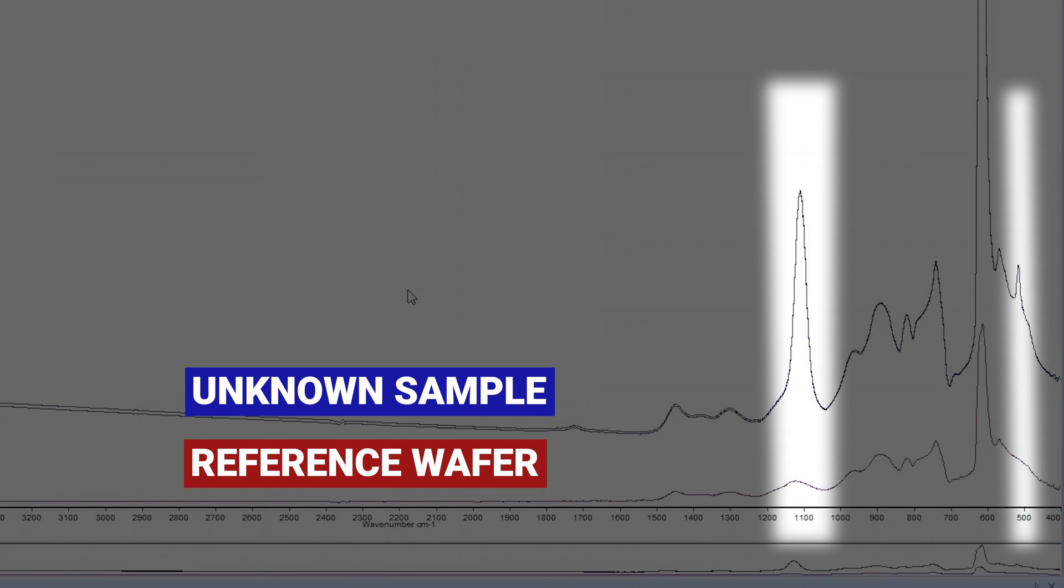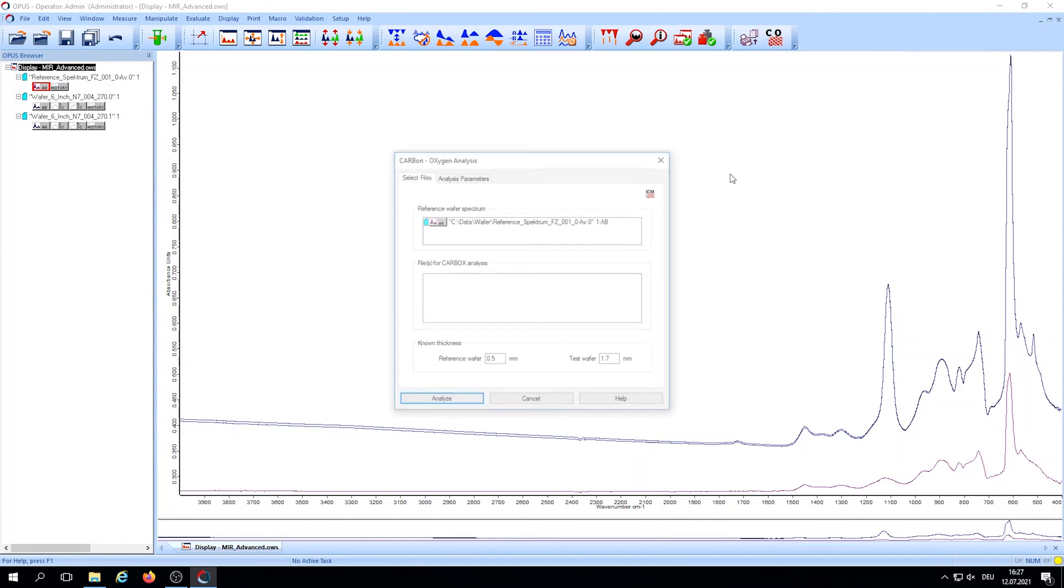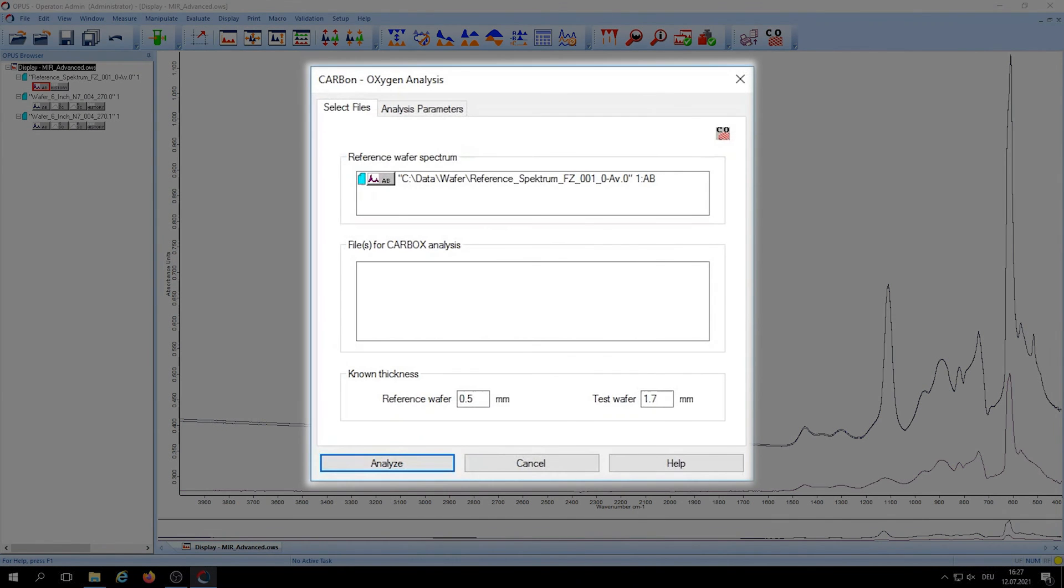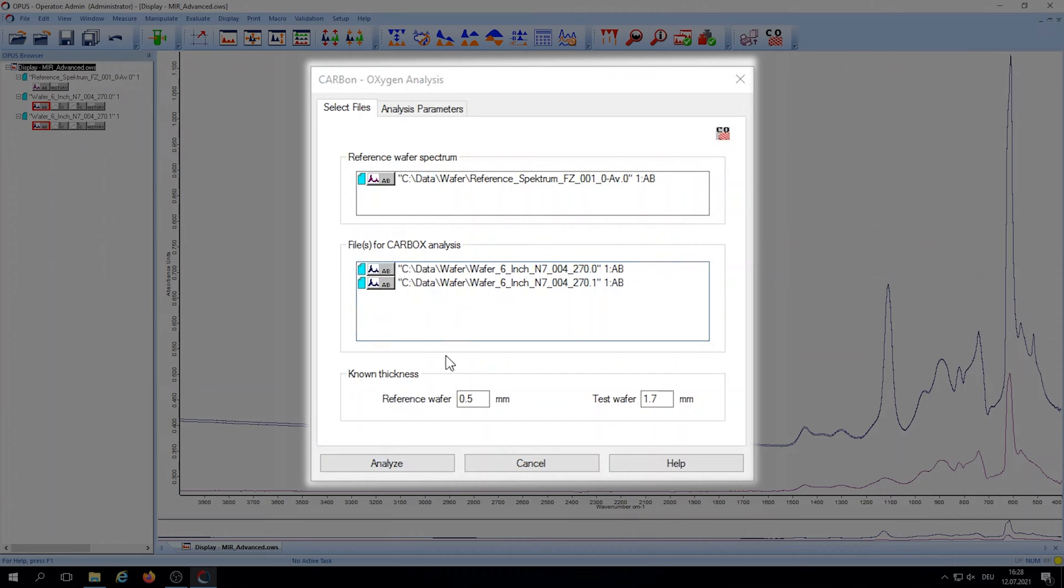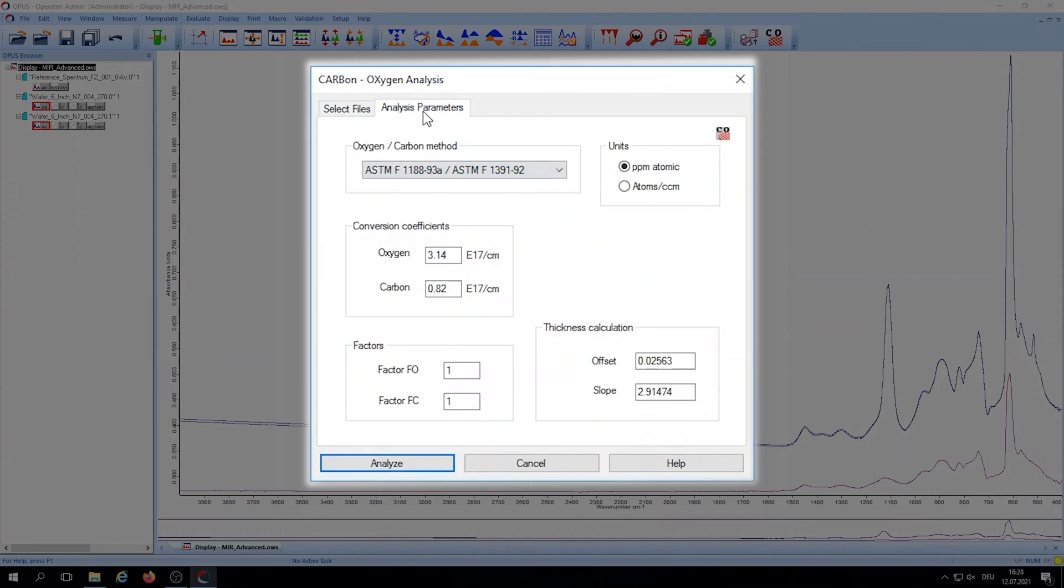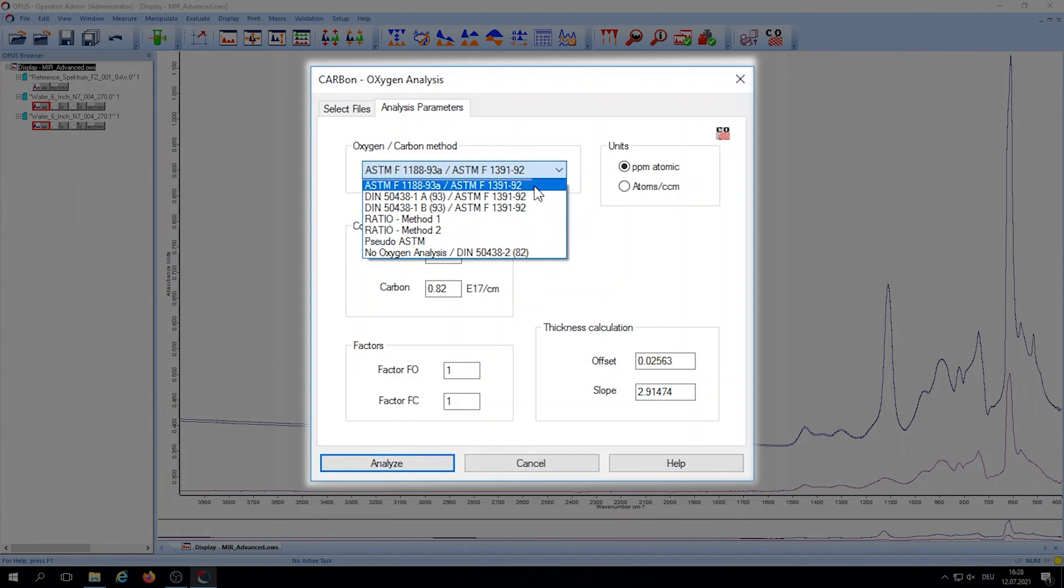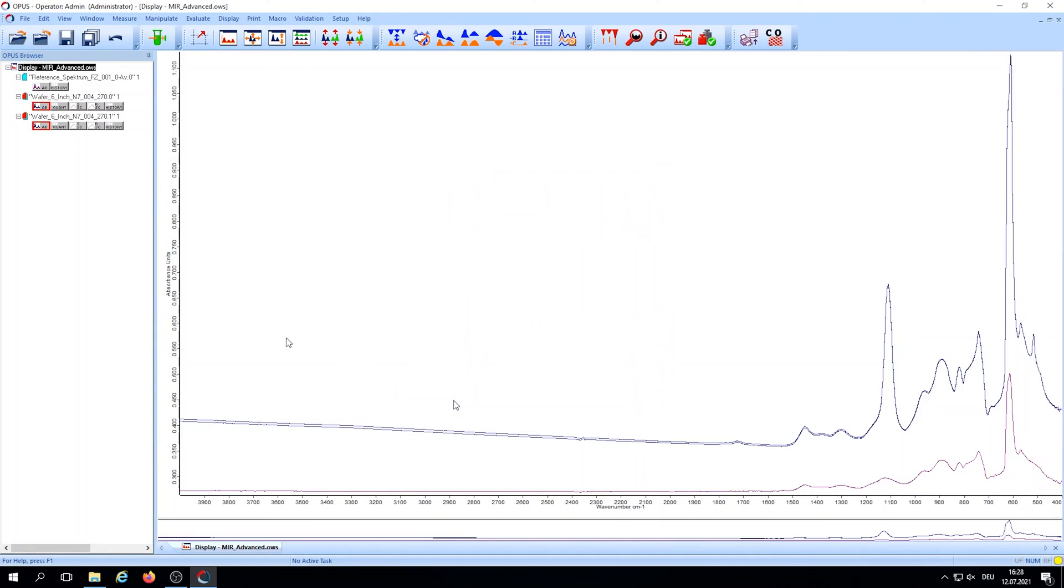We'll determine the carbon and oxygen content now using a dedicated function of OPUS. First we load the reference into the method, then add the sample measurements we just made. We'll enter the thickness of the reference and sample next, which should be similar to get the best results. There are different standardized methods for this type of analysis like ASTM and DIN which can be selected here, and then we can start the analysis.